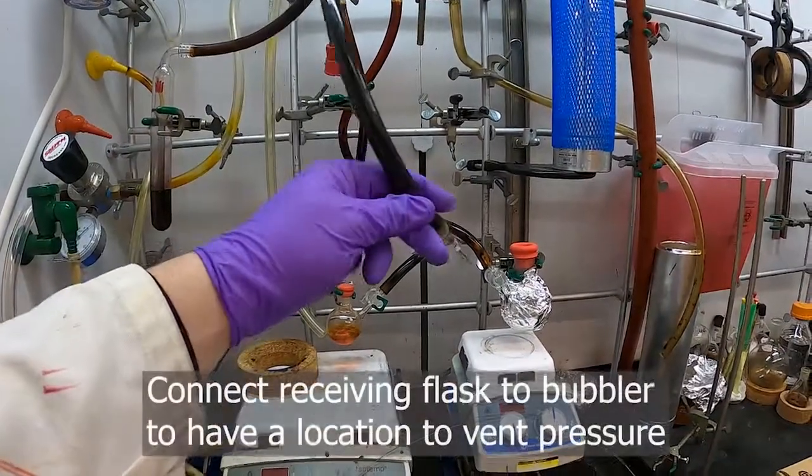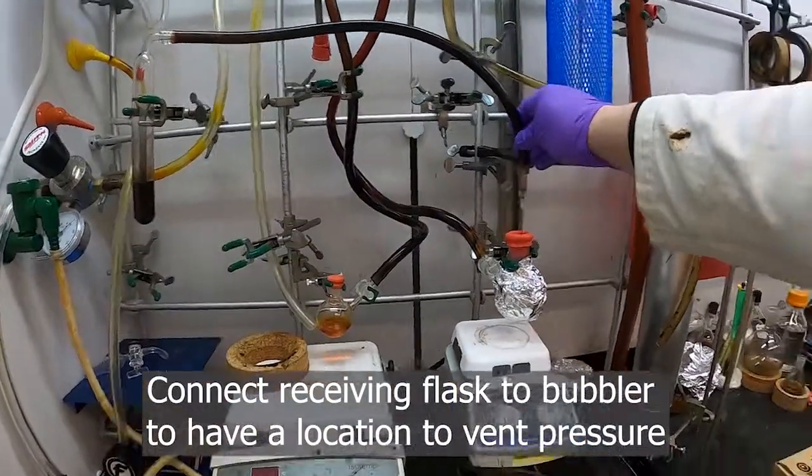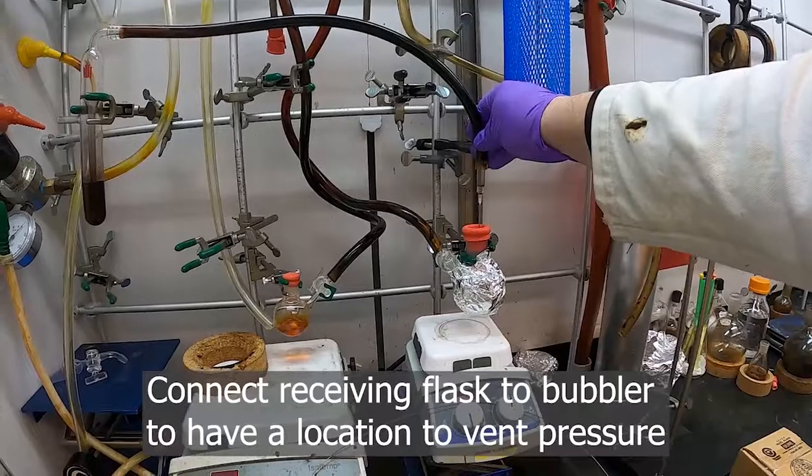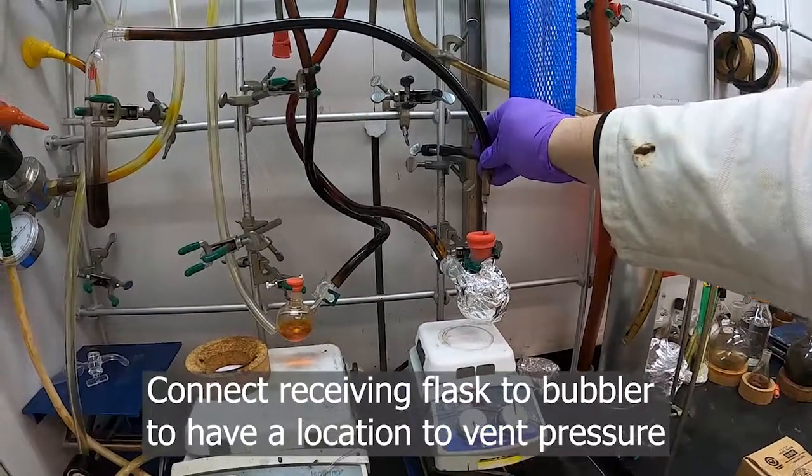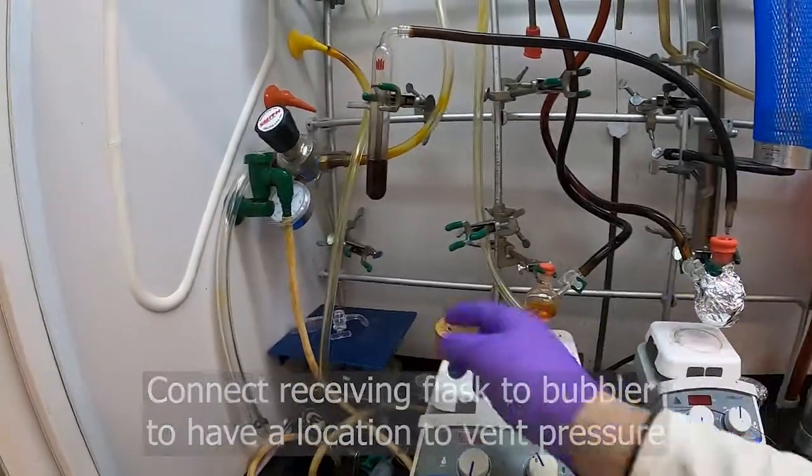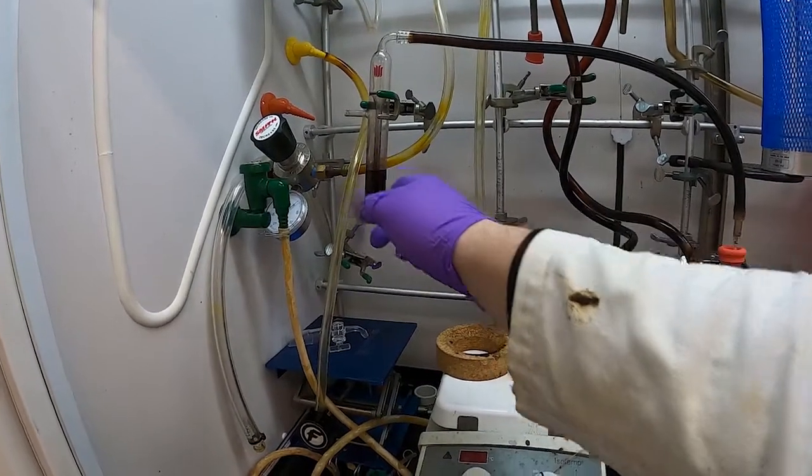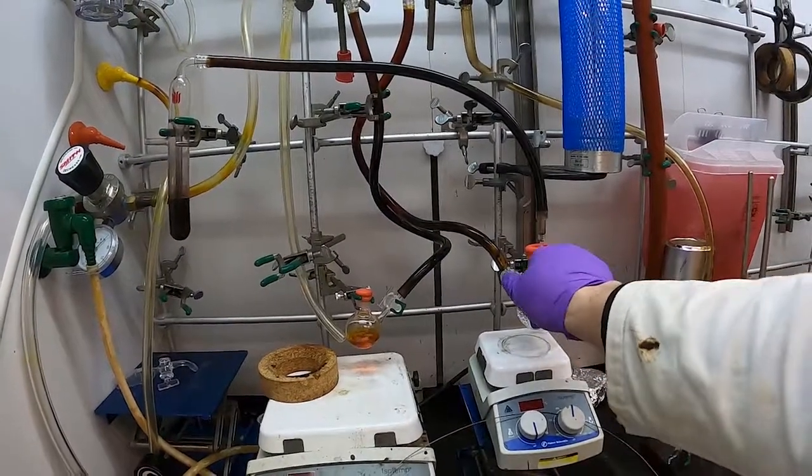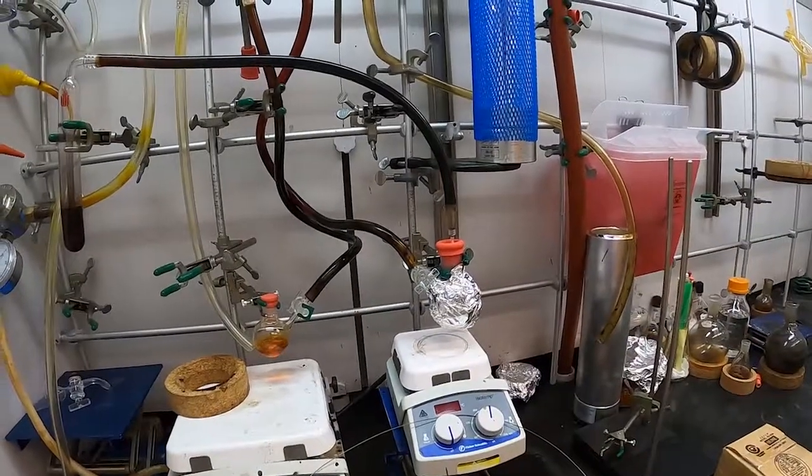The first thing I'm going to do is take my bubbler and put it into the flask that's going to receive my solution via cannula. That will relieve some of the pressure and cause a partial vacuum here.